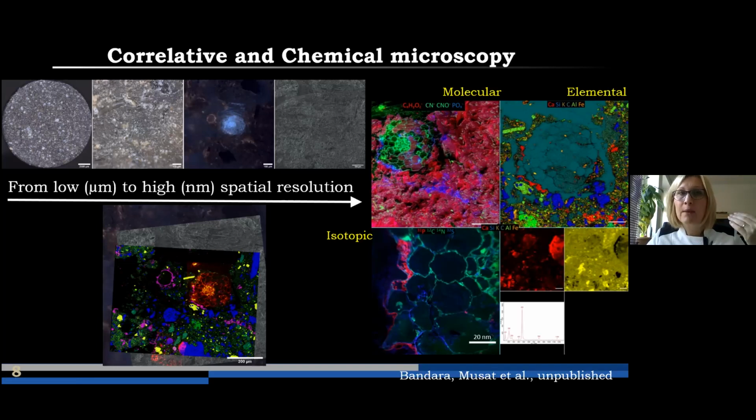Particularly, our scientific question is what is happening around these root fragments and how the plant roots contribute to the transport of organic carbon in the rhizosphere. And then the next image is a HIM image, a high resolution image to spot the same section. And further on, we go to the nanoscale resolution instruments to get molecular, elemental and isotopic mapping at the root and in the surroundings.